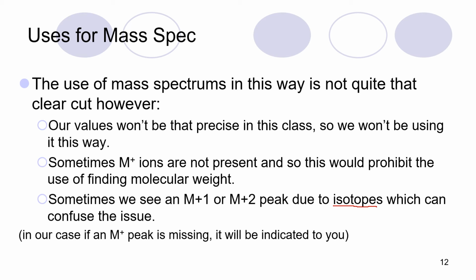Just to give you a little comfort, whenever we're dealing with these kinds of problems, if the M plus peak is missing, I will always indicate it to you and tell you what the M plus peak should be, because we're really just going at the very simple end of things here.